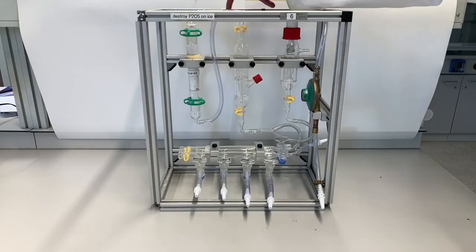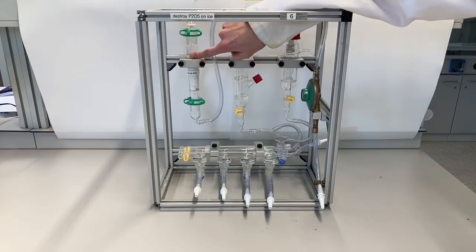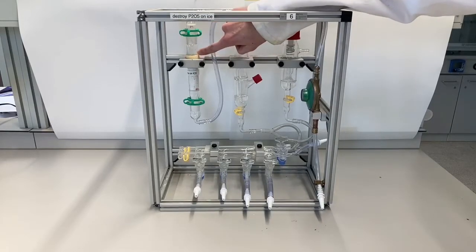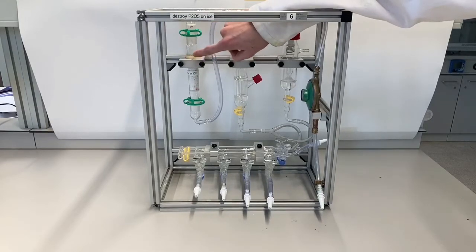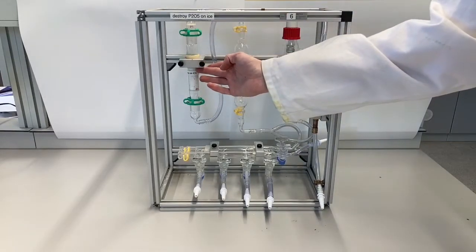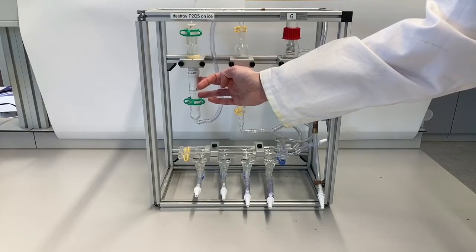Then the nitrogen will go through this line into this column of P2O5 — P2O5 with a blue indicator called Sicapent. On the top it is already blue but on the bottom it is still white. If it turns completely blue, that means it no longer dries your nitrogen and you have to replace the P2O5.